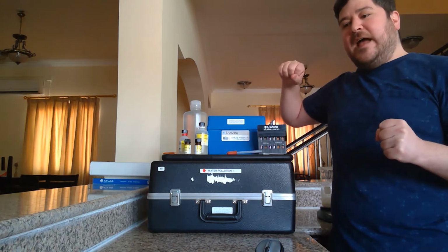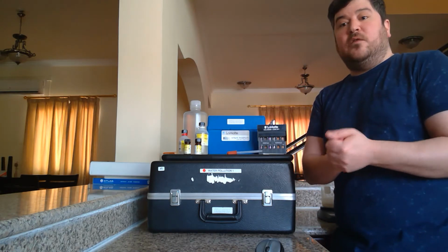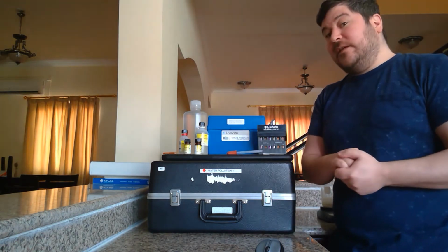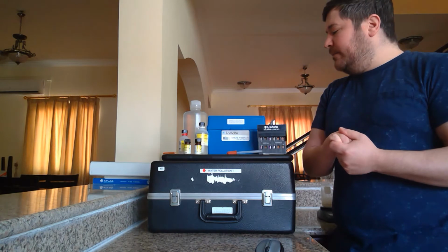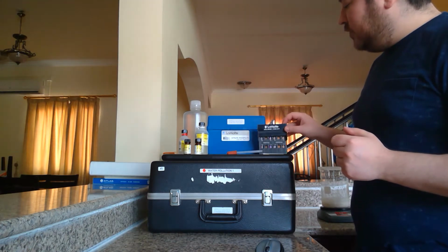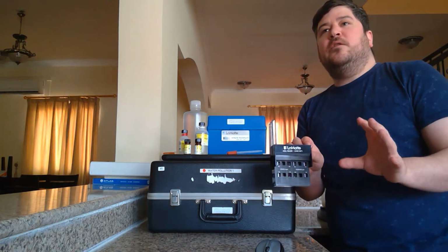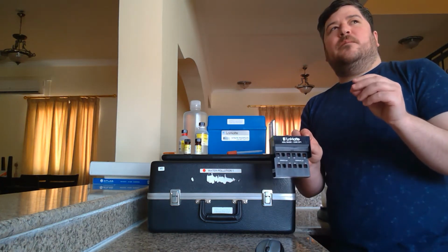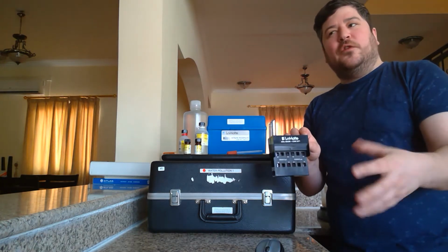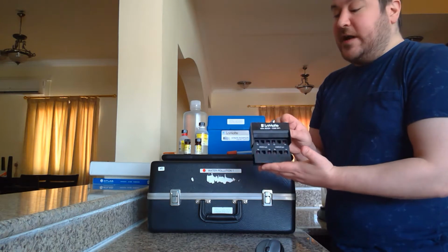I wouldn't say it's as accurate as an ion selective test where we would use Vernier equipment in the lab, an electronic device is basically what I'm saying. This is less precise, more subjective, because the kit involves us using a comparator, a reader, and comparing colors. Think of this like using an indicator or a litmus test versus using a pH meter. So instead of using a meter, I have a color system which I have to go by.